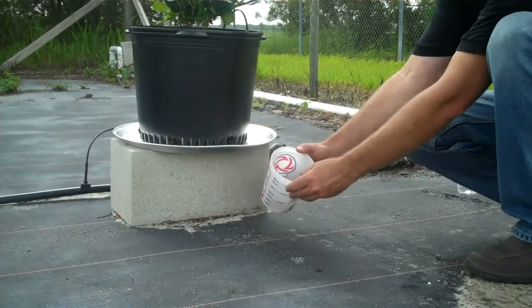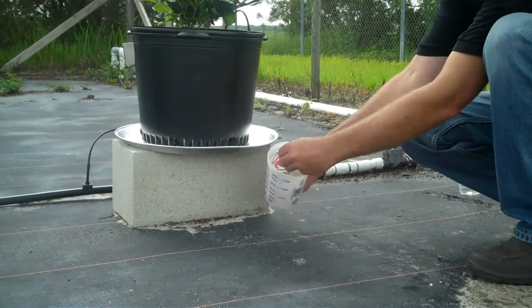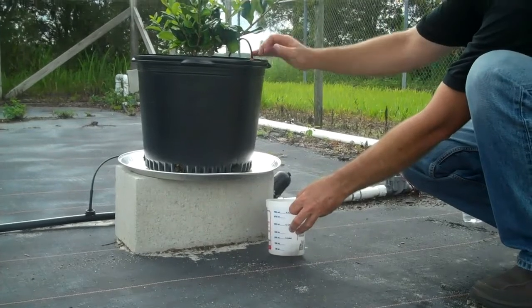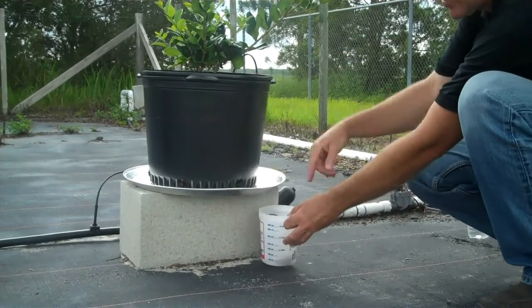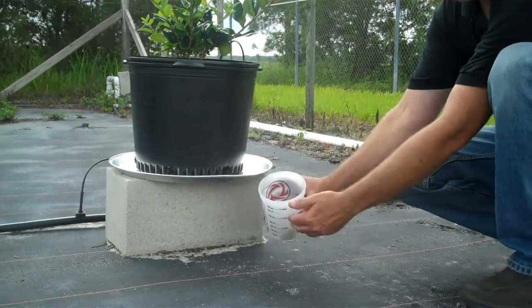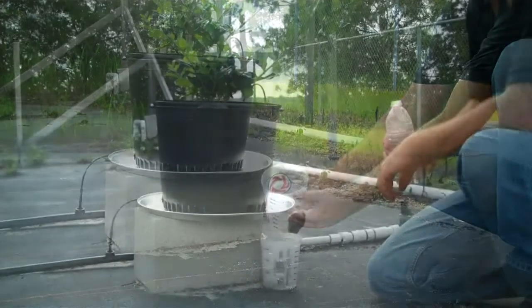A good thing to do, if you're leaving this out in the field, is to put a rock in there to hold the cups down. You know how much water went in by the amount of time, and you know how much water came out. That's your leaching fraction. You can take this water now and measure pH and EC.